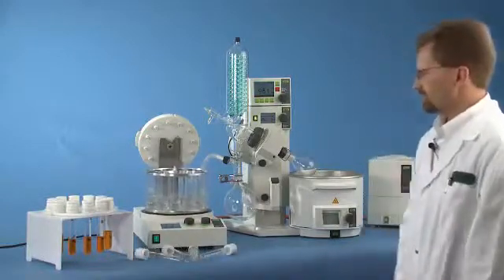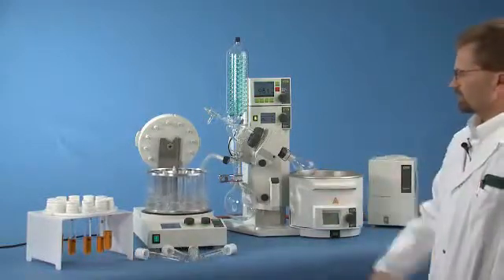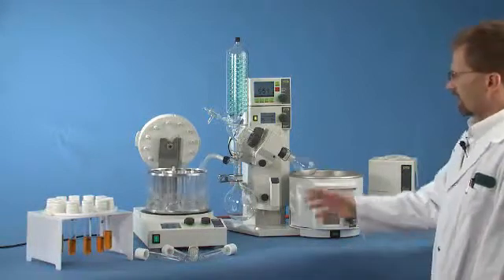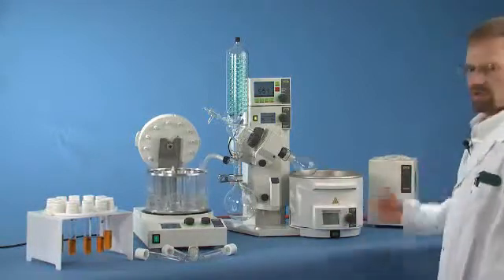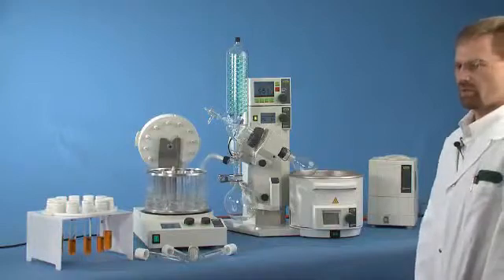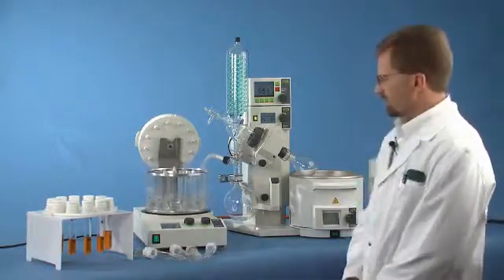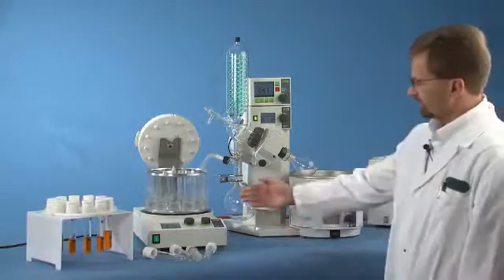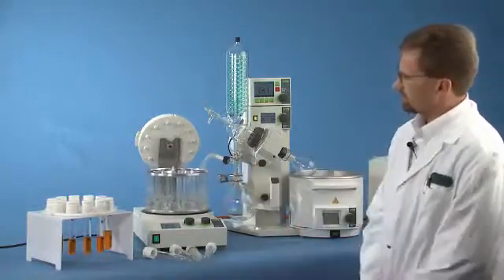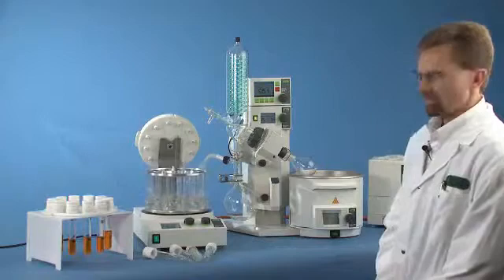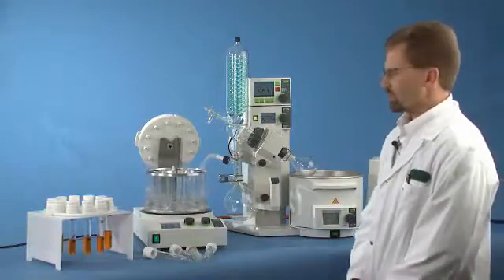The price for the Multivapor is very attractive. It allows you to do 12 parallel evaporations without having to buy an extra vacuum pump, vacuum control source, or a large centrifuge. The visibility of it is obviously beneficial as well because we have glass and liquid water, we can visualize our evaporation procedure in process.